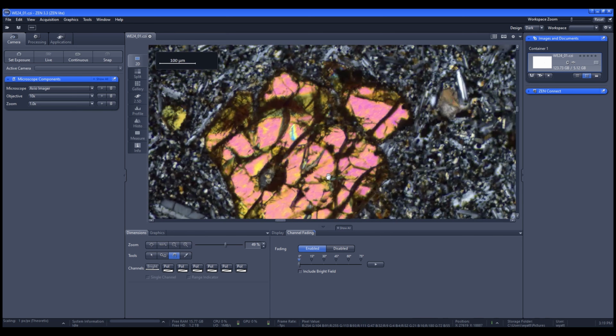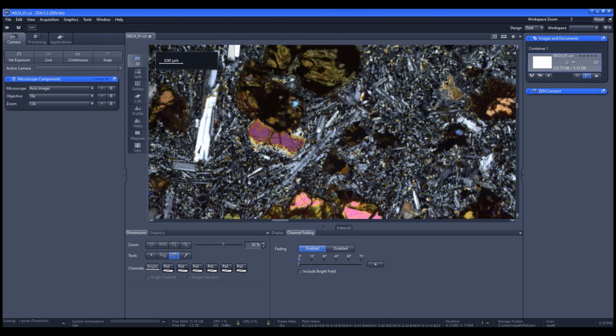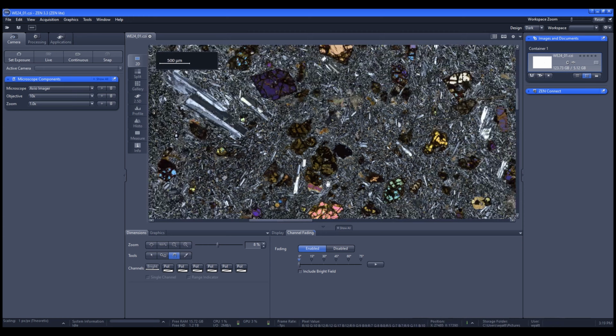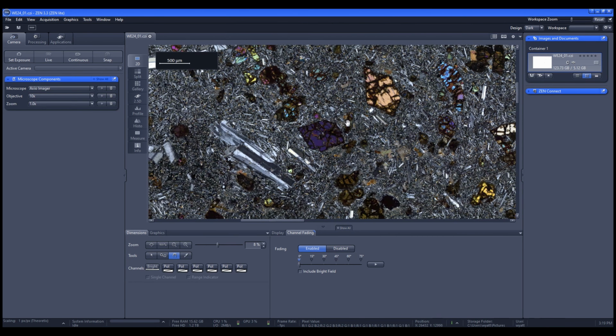So you'll see these fractures in the olivine. They're kind of turning brown. This olivine's really bad with it, so this is being fully altered and breaking down into iddingsite. So a lot of the olivines are being iddingsitized, I believe is the term for it.